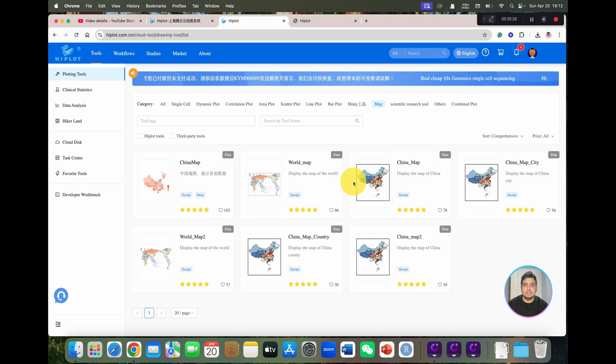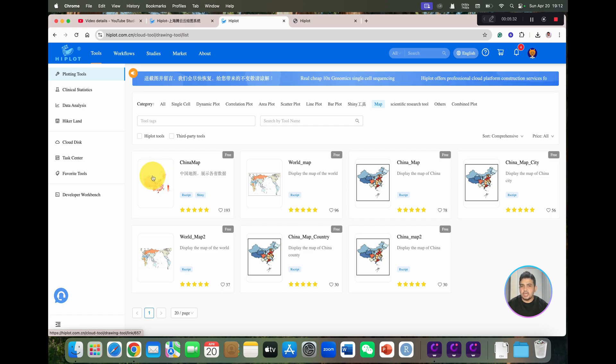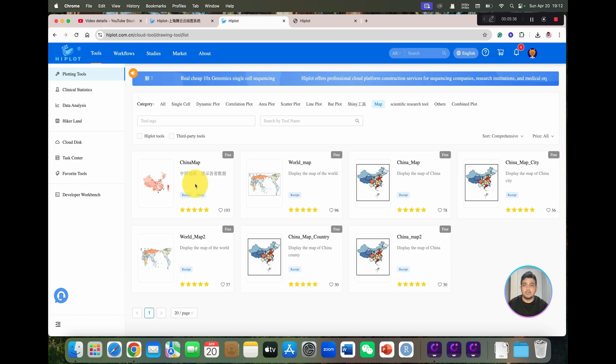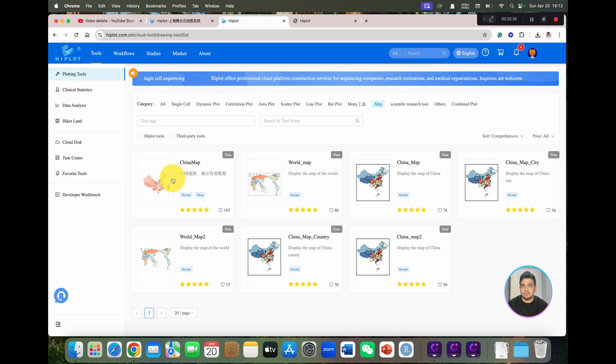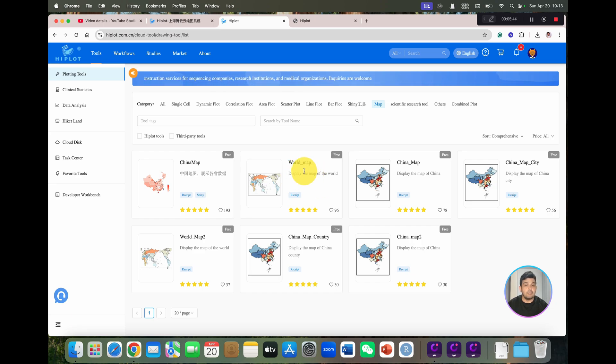If you can see in the map section, you can also draw China map, because this app was originally developed, in fact most of the web-based tools were developed from China. And as you can see, you can even draw your world map.